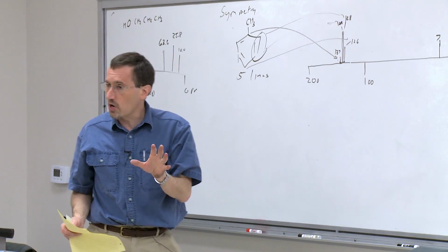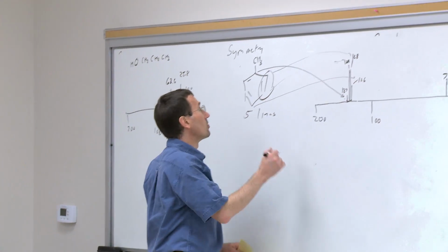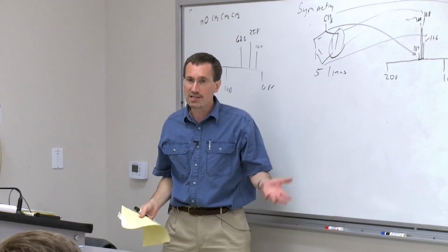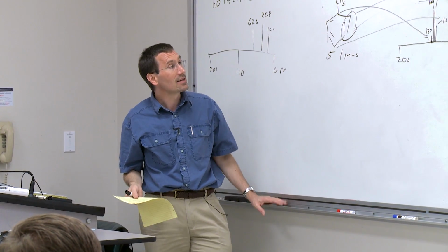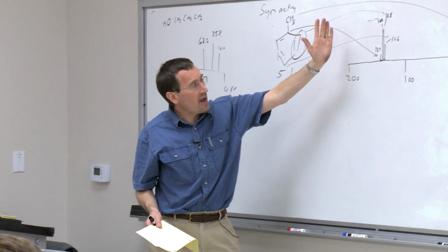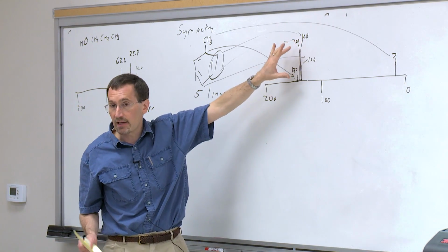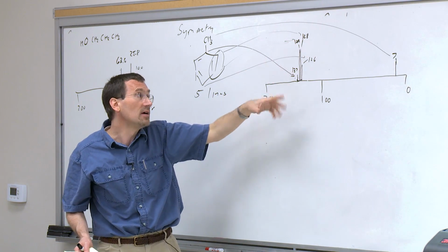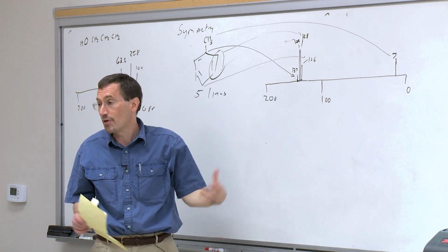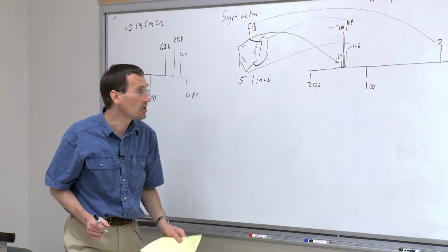You'll notice the methyl group. Remember I said we're only talking rough numbers on ranges. You'll notice the methyl group here is at 7 parts per million. And again, that's no big surprise. Those numbers 10 to 40 are not carved in stone. But the main thing, if I were looking at this spectrum here, I'd say, oh, we've got 5 unique carbons. It looks like an aromatic compound, probably because if it were 2, I'd say maybe it's an alkene, maybe it's aromatic. With 4, I'd say probably an aromatic. But other clues will clue you in, like degrees of unsaturation and so forth.